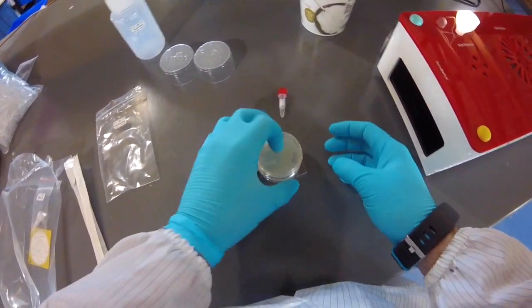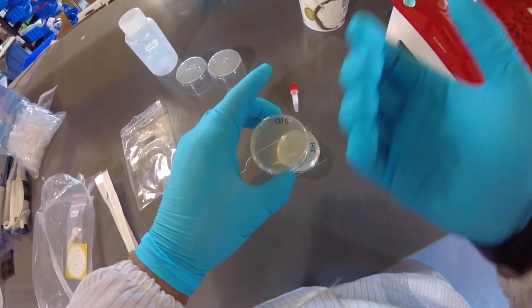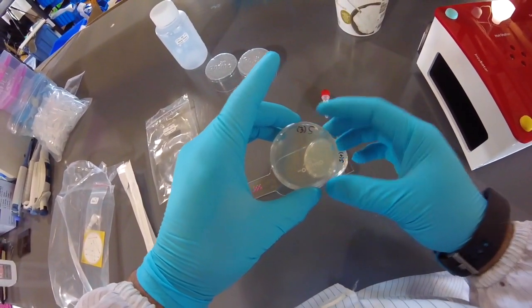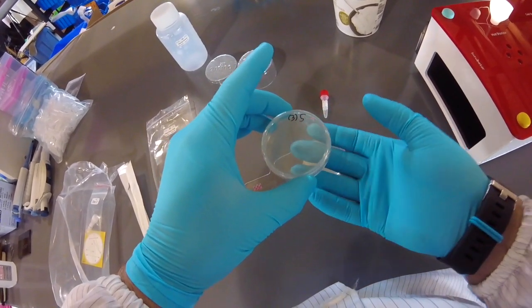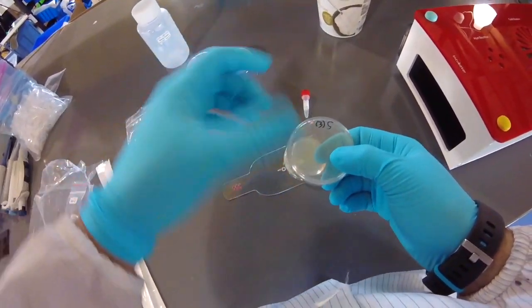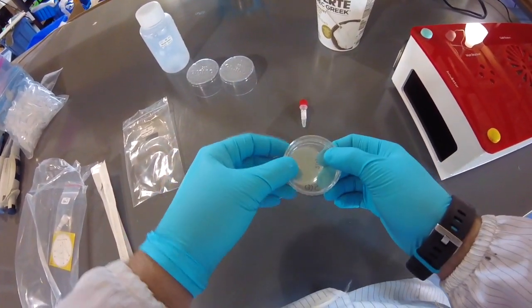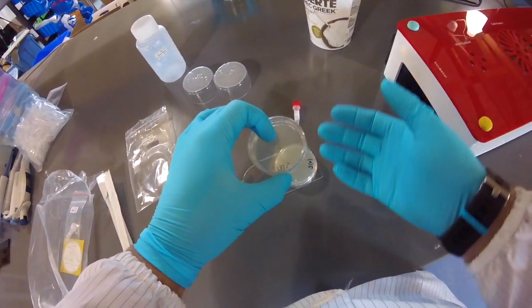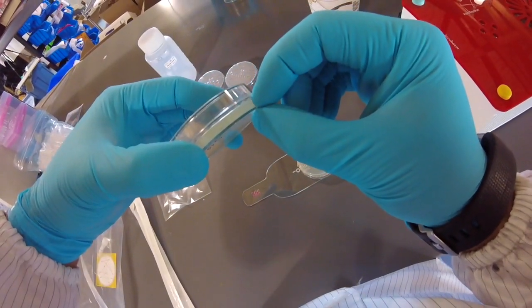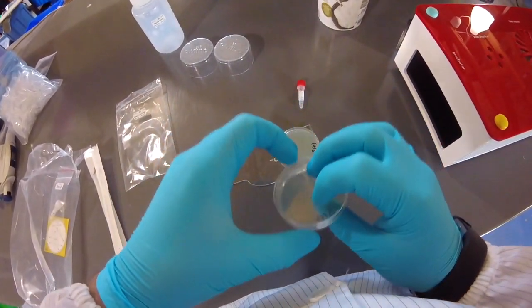Flip your plates upside down, so the top is underneath here. As this heats up, 37 degrees is a pretty hot environment. It's going to cause evaporation of the water that's in the agar, and by flipping upside down, it helps to trap the evaporated water in the Petri dish and keep the surface of the agar nice and humid so the cells grow. If you were to incubate them like this, the plate would dry out much more rapidly, it'll thin out, and the surface of the plate will be a lot drier and the cells won't do so well.